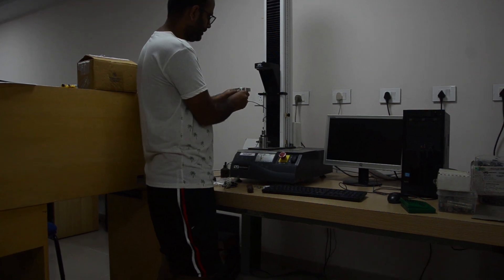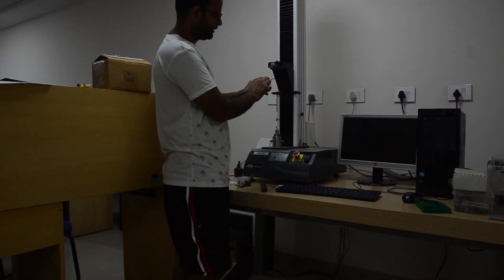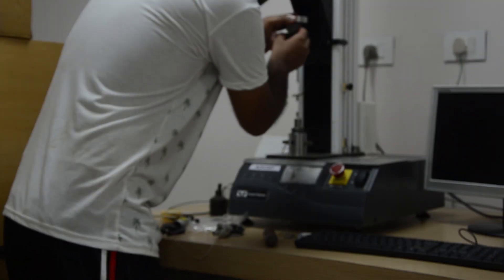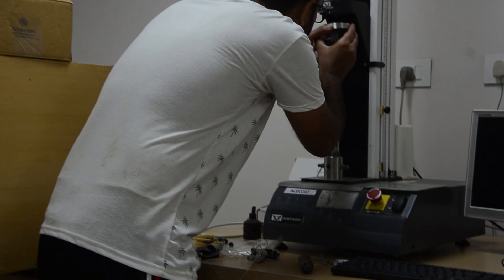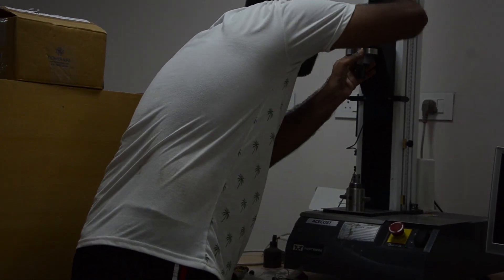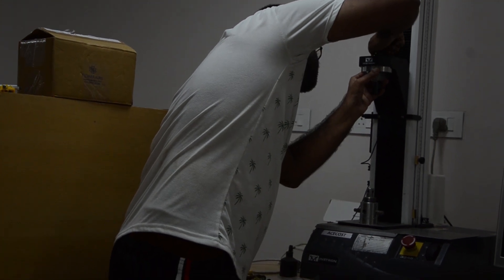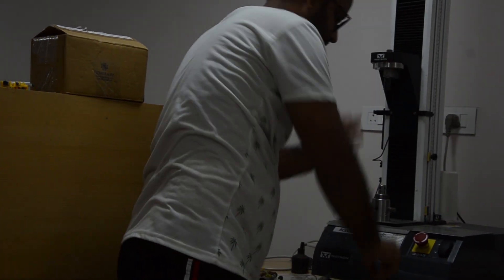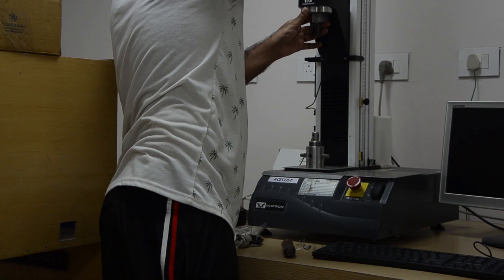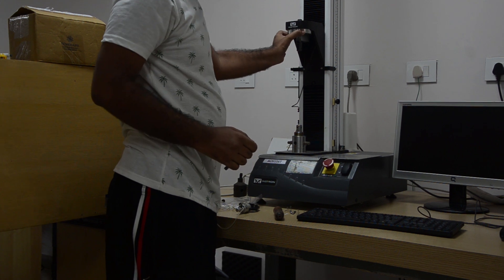I am going to show you how to put the 5 Newton load cell here. There is a ring — we have to keep it in the slot so that it will go and hold it. We simply tighten it here, lightly, so that it is not loose.